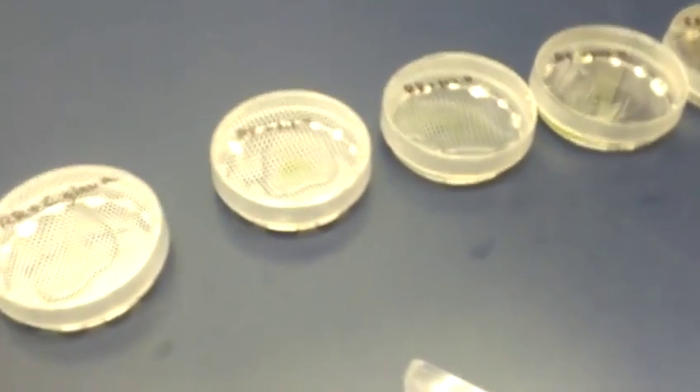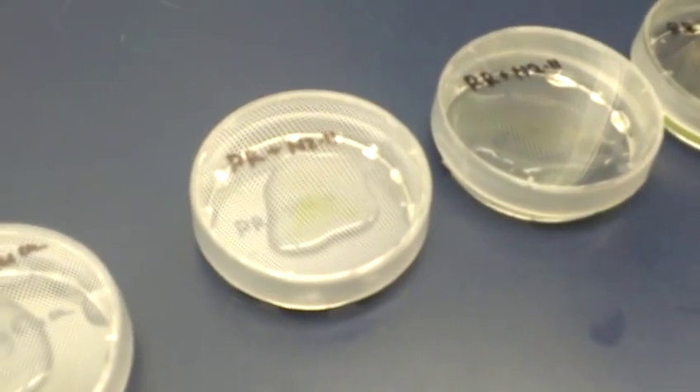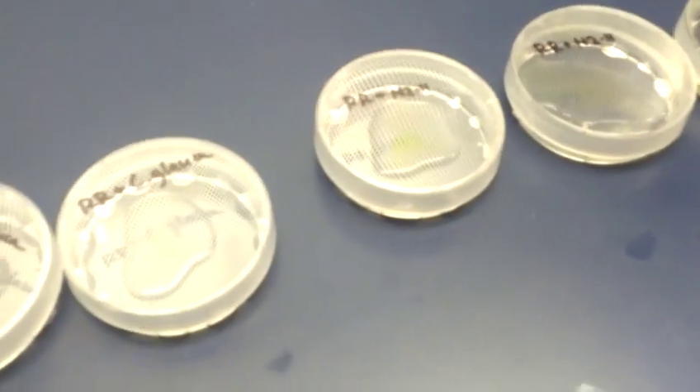In the plate, there's not a whole lot you can see going on from the naked eye.